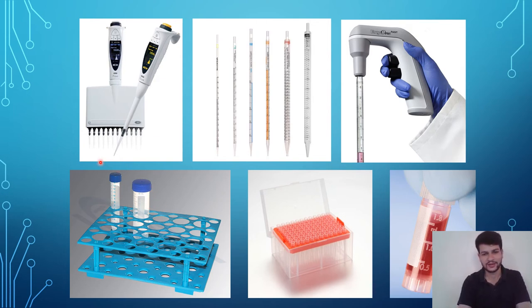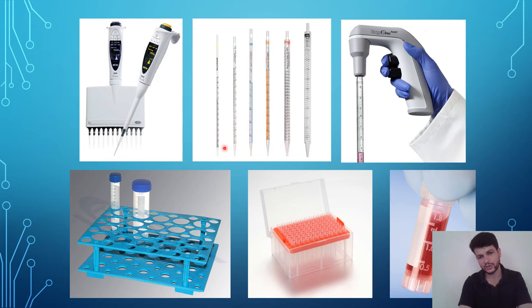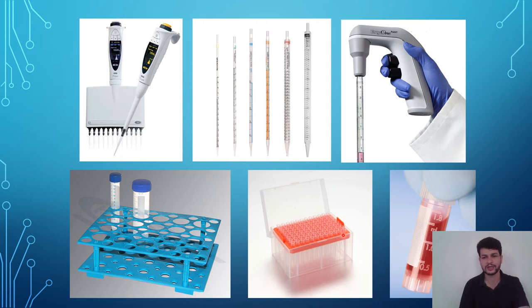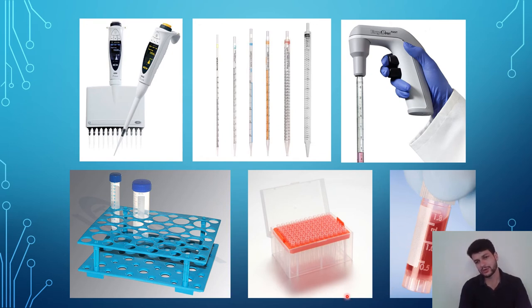These are tubes commonly used in cell culture: this is the 50 ml falcon and this is the 15 ml falcon. These are the tips used with the cell culture pipettes. You have to discard these tips every time after use — if you are removing media from wells with different treatments or different cells, you have to change the tip every time. The same applies to these pipettes — you have to change and discard them accordingly.